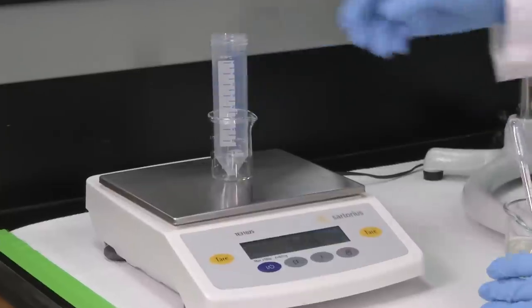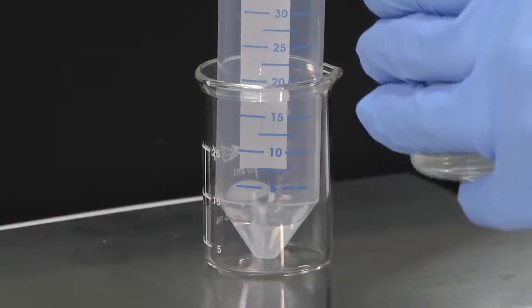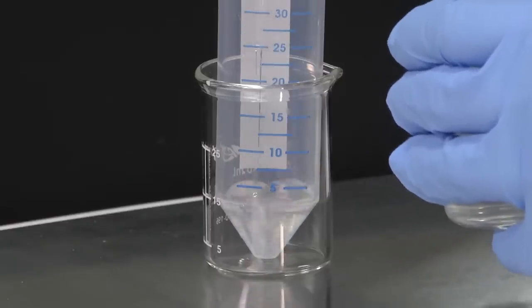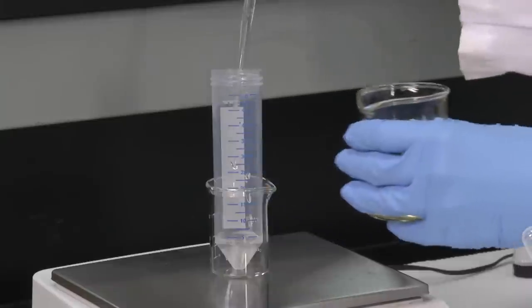Weigh 2 grams of protein solution into a conical 50 milliliter centrifuge tube. Then add 3 grams of oil to that tube.